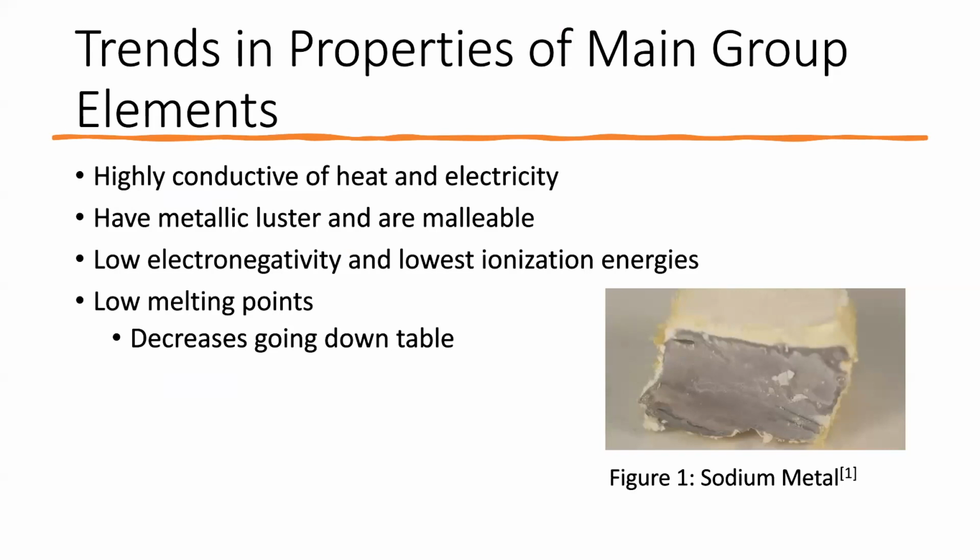As you can see in figure 1, this sodium metal was freshly cut, so the cut part is quite metallic, but the outer surface has already been oxidized by the atmosphere and now has lost that metallic luster.